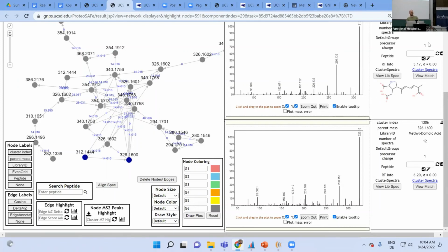Okay, another question? So again, in this case, I have 2 domoic acids and 3 methyl domoic acids. Is that okay? That could actually be the case, because there are a couple of regioisomers of domoic acid. So I would not be surprised if there were multiple chromatographic peaks, but it would ring a little bit of a bell.